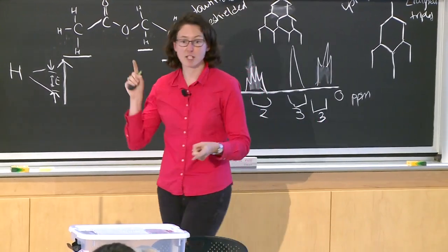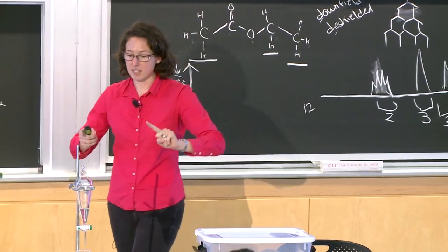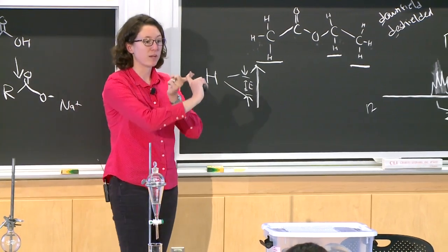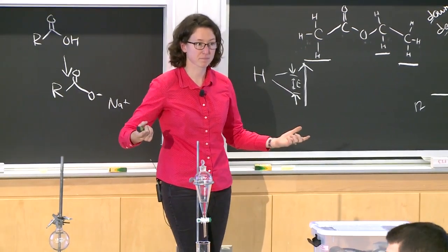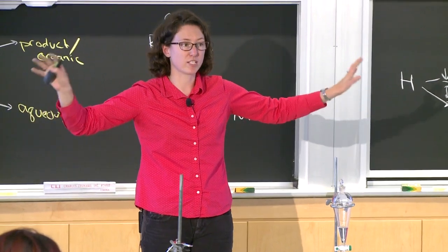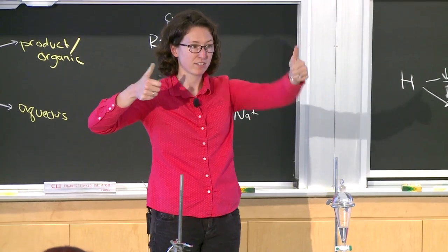and we do not want to mix in between, especially not acetone with the catalase waste. If you remember from before, we may have talked about this. You will hear about it again. If you mix the acetone from any of these organic labs with the hydrogen peroxide from the catalase waste, you will generate explosives. So we are not going to do that because everybody's going to read the waste labels and dispose of their waste properly in this lab and keep everything in the hood that should be. Good? Excellent.